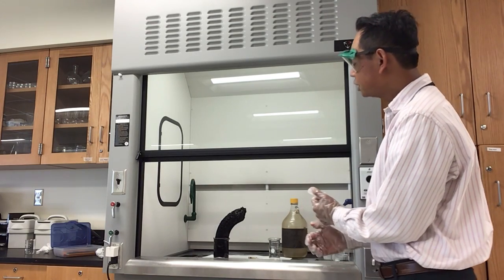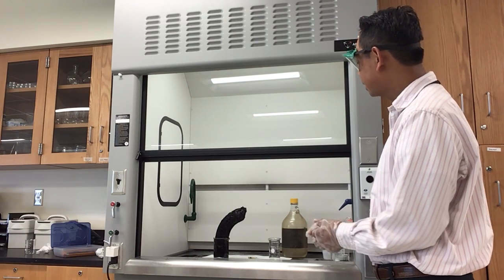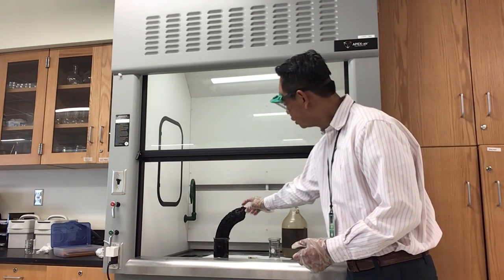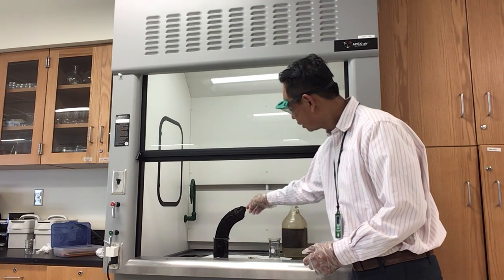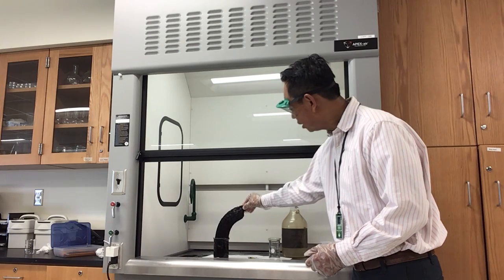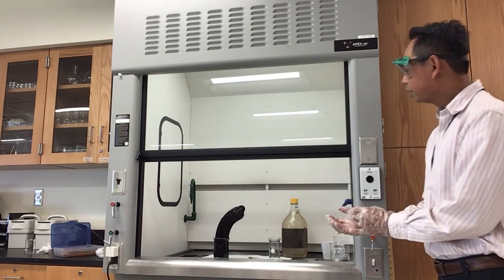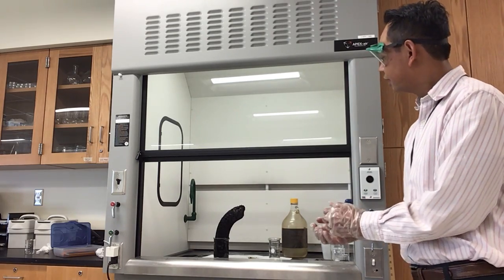So chemical reactions, when something heats up, you see smoke, you see bubbles, you see steam, okay? Do all that. And this is pure carbon. There's no hydrogen, there's no oxygen, it's still very hot, okay? And it's just kind of flaky, okay? All right, so we'll call this sugar high, sugar rush, all right? Write that down.